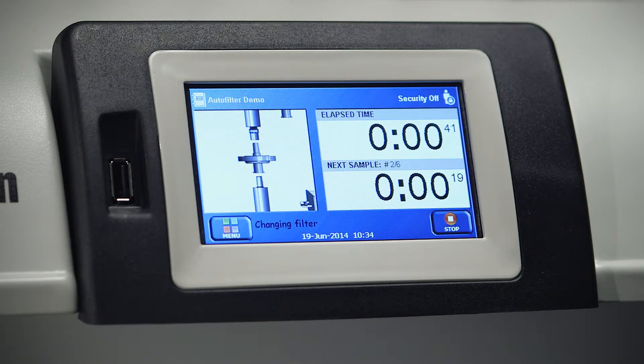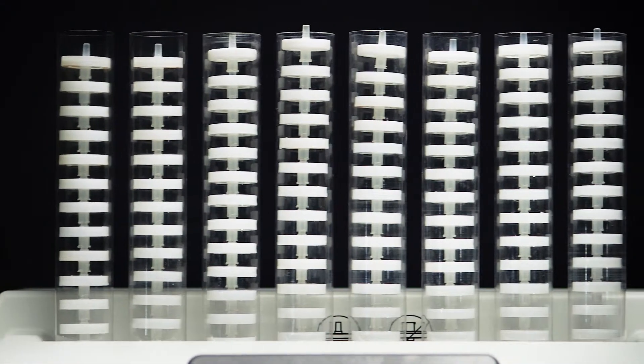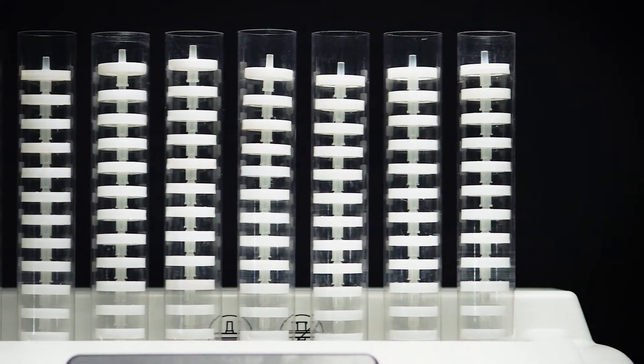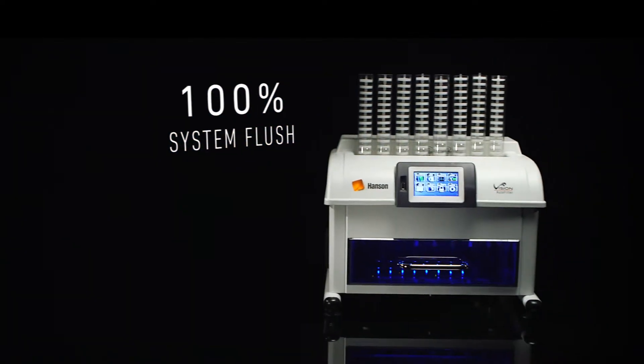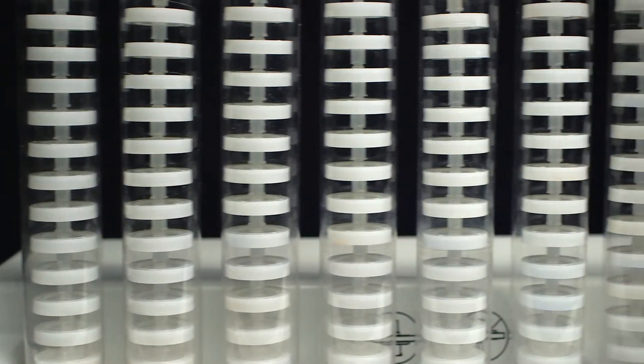The Vision Auto Filter Changer can then automatically return those same filters back into the fluidic path for filtered sampling — all of which is completely programmable. No manual reconfiguration needed and no time wasted.